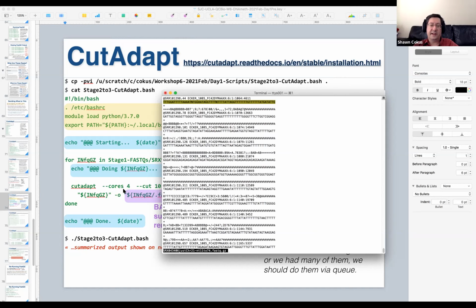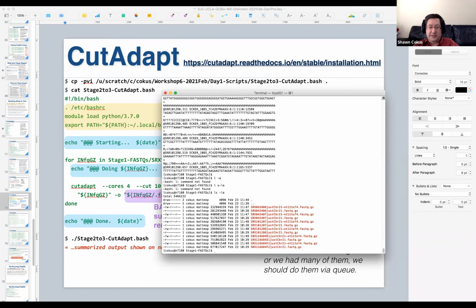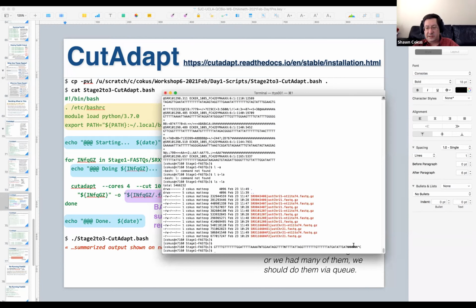I'm going to copy that line here and save that in my clipboard, so that I can use this without going through the pain of sharing another window here. Here, I'm going to paste it in. That is the sequence, the original sequence. The Control-C there is just to get a new line here. I didn't want to run that as a command. I'm just using this as a little display area here. That is the sequence from the trimmed file.